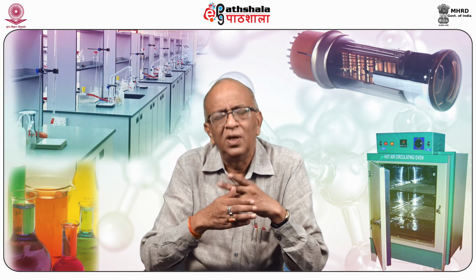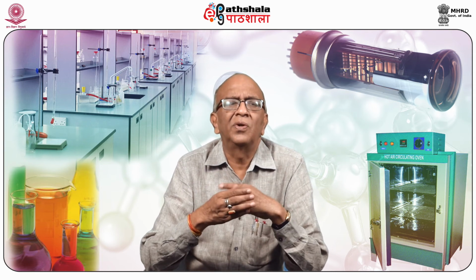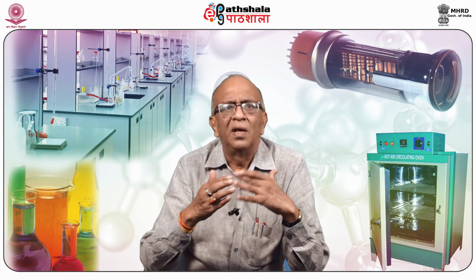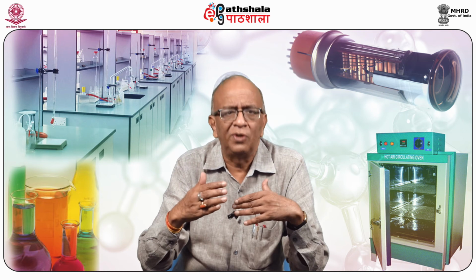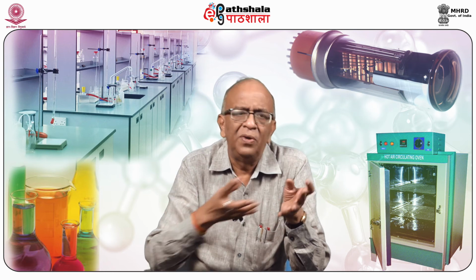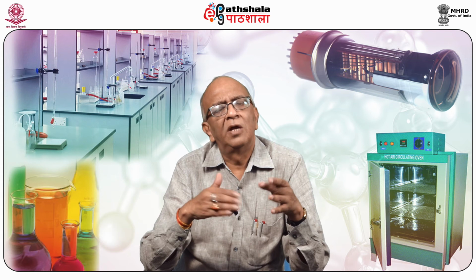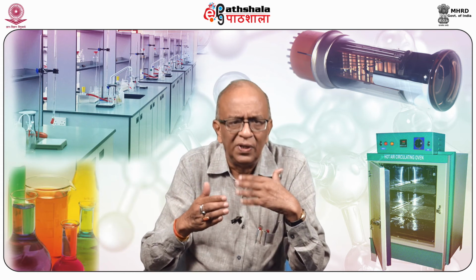For that purpose, we take thin layer chromatography. In thin layer chromatography, we may take a thick layer of the adsorbent, and on that, bands will appear in the form of pure substances from the mixture. These can be scratched out, and by putting them in a proper solvent we can recover the substance. So thin layer chromatography can be used for qualitative as well as quantitative purposes.